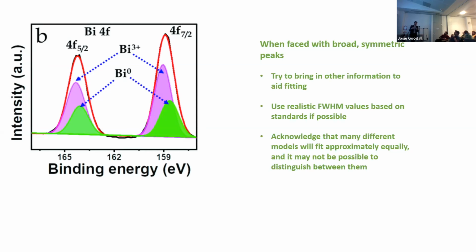But to be honest, you really need to look at your own system, whatever system you're on. So that's why I think doing things like measuring standards is really important.